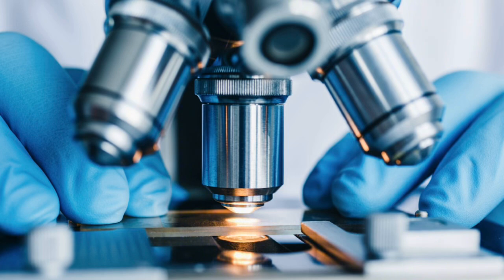The stage is a flat platform where evidence is placed. In forensic work, the stage must hold samples steady to prevent movement, since even a slight shift can distort observation. Some microscopes include a mechanical stage to allow evidence to be moved precisely without touching it directly.